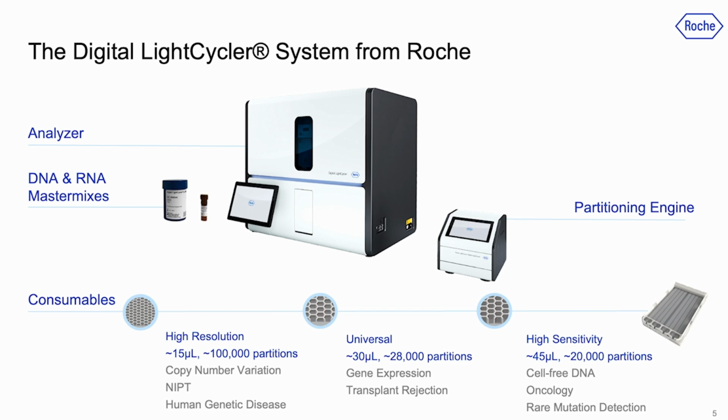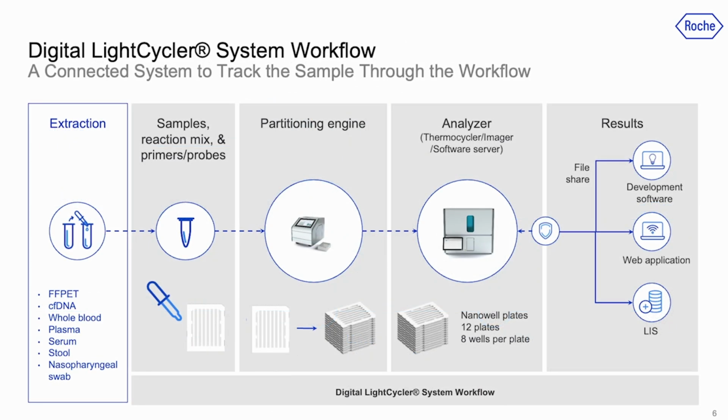So now that you're a little bit familiar with the system components, I'd like to walk you through a workflow. I'm going to be focusing on the diagnostic workflow. In this case, you can imagine that you have samples that need to be run. What you need to do originally in the diagnostic workflow is to use that input of the samples that you'd like to run in the batch, for instance, through the web application. Now, this can be done manually, or it can be associated from orders that come from an established LIS system.